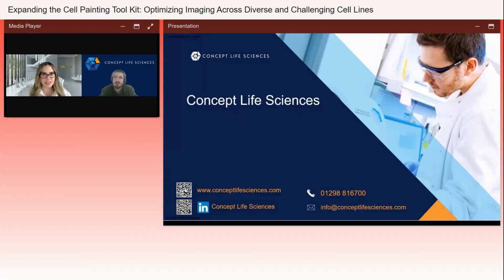All right, fantastic. This next one says, can you please say a bit more about the instrument itself? What objectives does it contain? Z-stacks? To which extent can you use it instead of the confocal microscope? So the instrument itself, I can plug for Thermo Fisher. It's got a number of different objectives. The ones we have access to are between 10 and 40x, although it goes down to, I believe, 1.25 or 4x and up to 60.